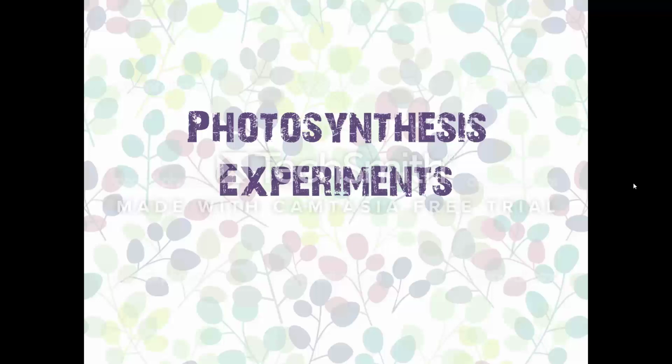So in saying that, we are going to do a number of experiments that will prove photosynthesis has taken place. But it's not as easy as, is there starch? Boom, yes, there's photosynthesis. No, we're going to test factors. So for example, if there is carbon dioxide available, will photosynthesis take place?